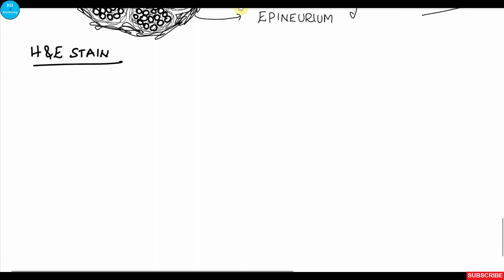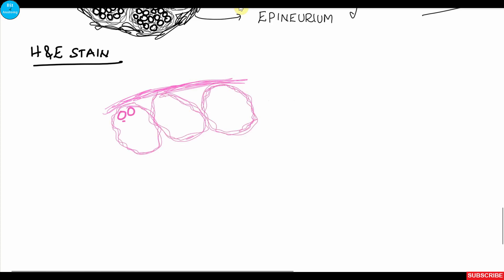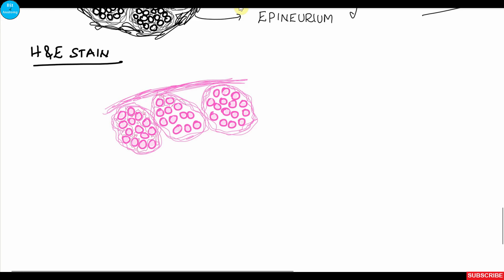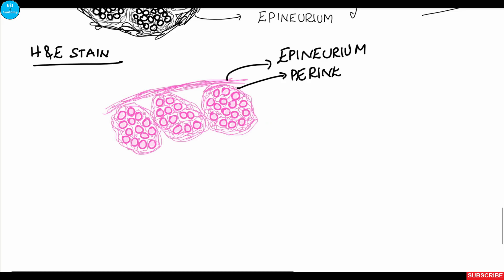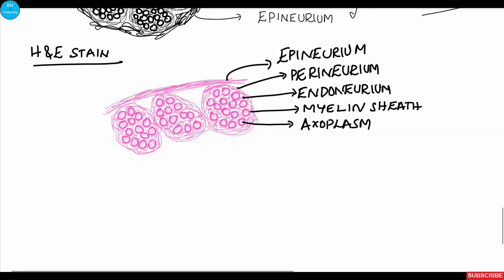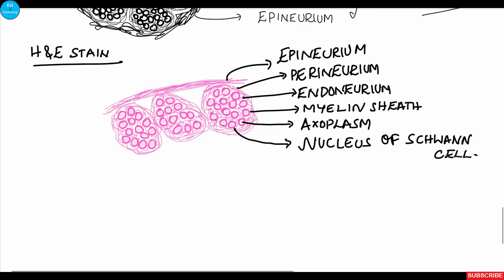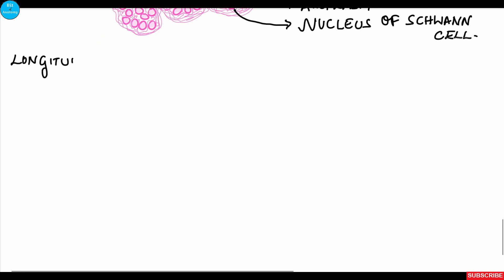In some colleges we can also see H&E stained slides where the myelin sheath is not perfectly stained but can still be appreciated taking up the eosin stain. We can see the epineurium layer, and within it we can see fascicles covered by perineurium. Inside that we can see the axons with myelin sheath, each surrounded by a small amount of endoneurium. In some axons we can appreciate a nucleus around the outer part of the myelin sheath — this is the nucleus of the Schwann cell, which forms the myelin sheath in the peripheral nervous system.